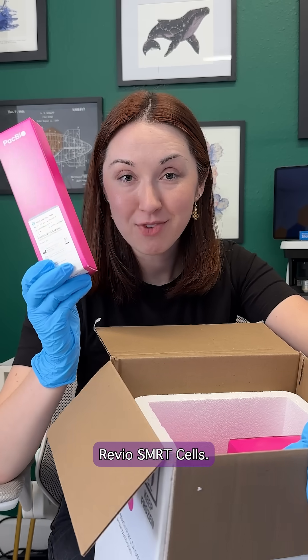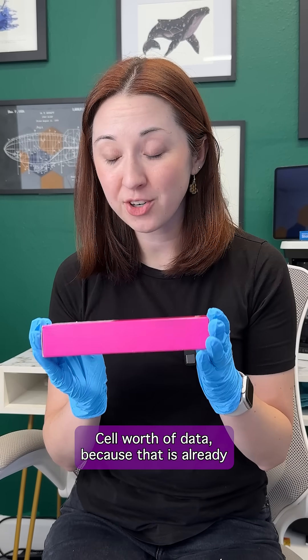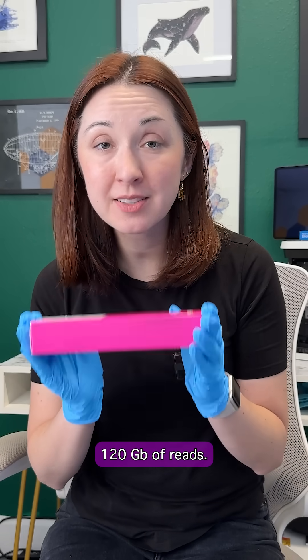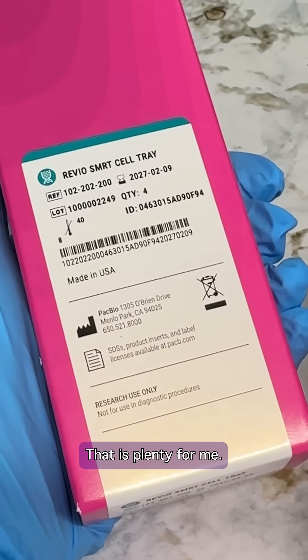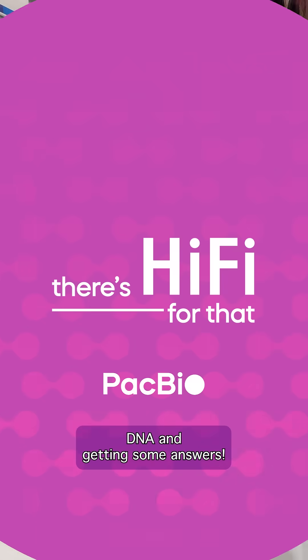And finally, the main event — Revio SMRT cells. I'm only going to need one SMRT cell's worth of data because that is already 120 gigabases of reads. That's about 384 microbial genomes — that is plenty for me. And now for the fun part: I get to start sequencing some DNA and getting some answers.